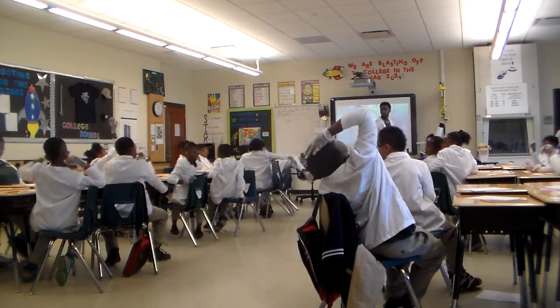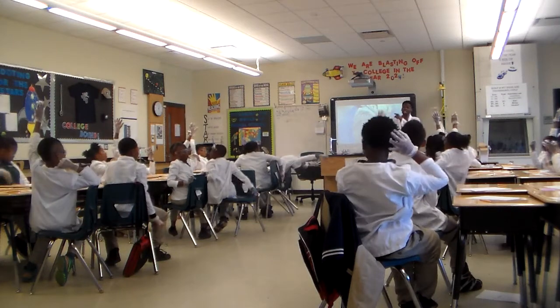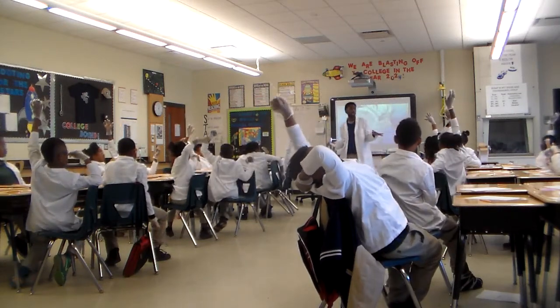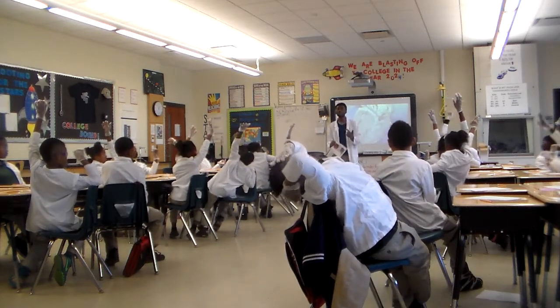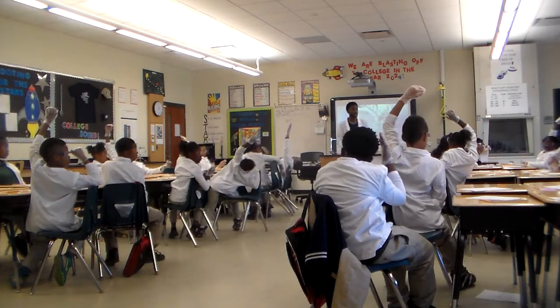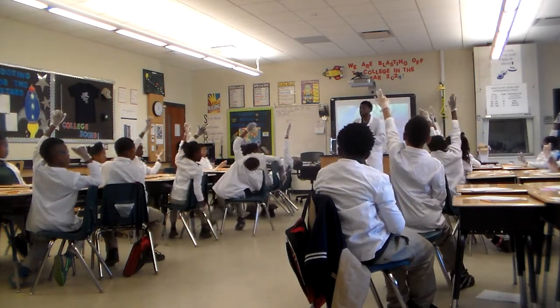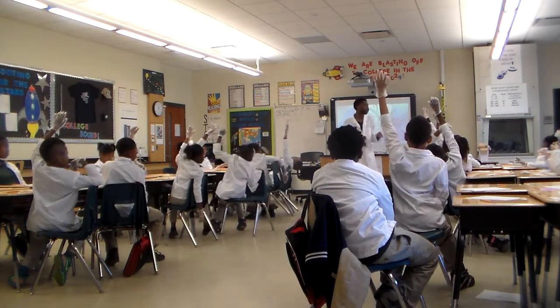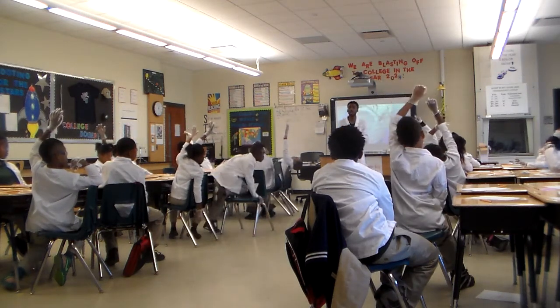Give me one, Jermaine. No horseplaying. No horse playing. I like that word. No horse playing, right? Because we have a lot of sharp objects around. And most importantly, we're going to be too busy studying our specimen to horseplay. Yes, sweetheart? Don't take off your gloves. Keep your gloves and your jackets on, right? Because these items are protecting us from any type of germs that we may encounter within the lab.